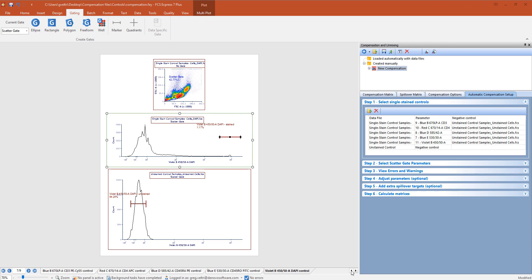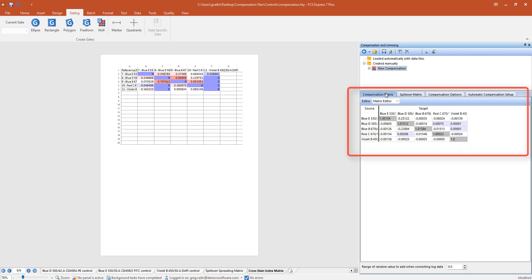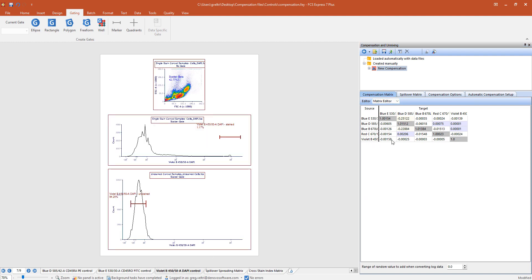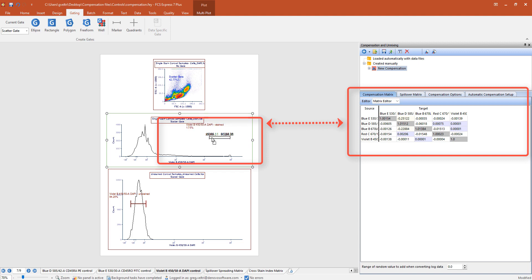To do a final review of the compensation and visualize the compensation and spillover spreading matrix in FCS Express, you will click on the spillover spreading or cross-stained index tabs to visualize those matrices. You can access the compensation or spillover matrix values from the tabs in the Compensation and Unmixing dialog. Remember, these were automatically created and displayed previously. If changes to the compensation gates are needed, you will navigate to the associated control page, adjust the markers, and the results in all the matrices will update in real time and are automatically saved to the matrix.